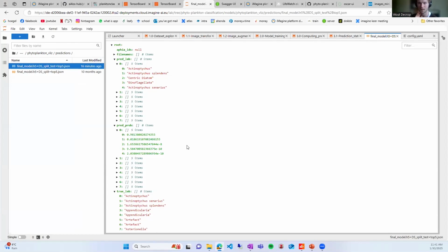And then for the predicted data, for non-annotated data, you only get the confidence of the model. So you have to check yourself if the model is correct. You know, with a certain confidence, you can say for some of these, like I showed in the images, the results.